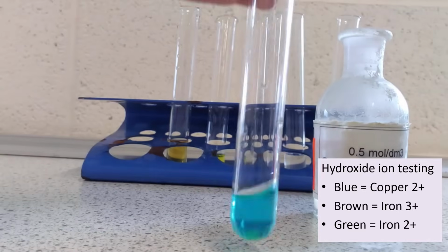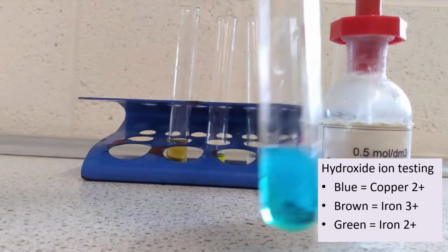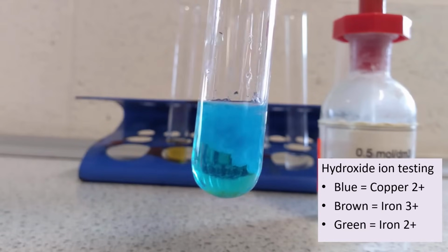So first up, I've got copper, and if I add the sodium hydroxide, you can see it was already blue, but now at the top you can see there's a sort of a blue solid, a blue precipitate being formed, and that is copper hydroxide.